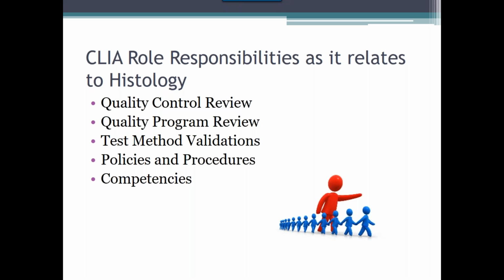This is often a pitfall for histology departments, as they often assume that whoever holds the histology supervisor role of the department for the organization can sign off on all documents alone, and they cannot. Similarly, the fact is often overlooked that only a technical supervisor can be delegated certain responsibilities by the medical director and not the general supervisor.